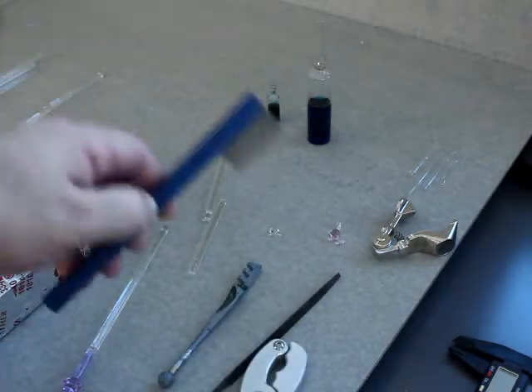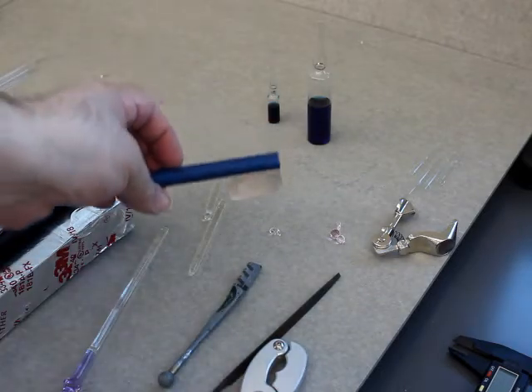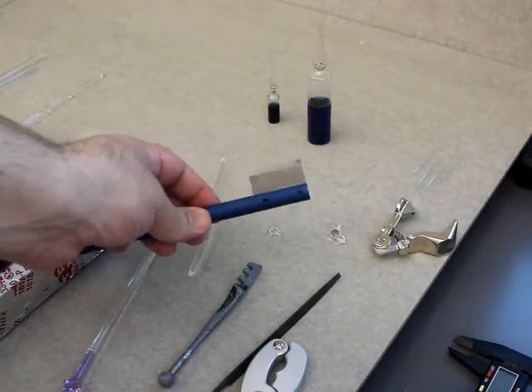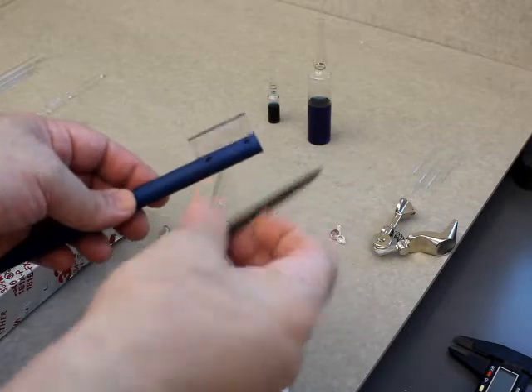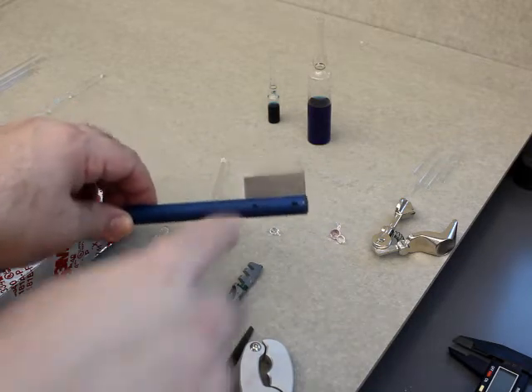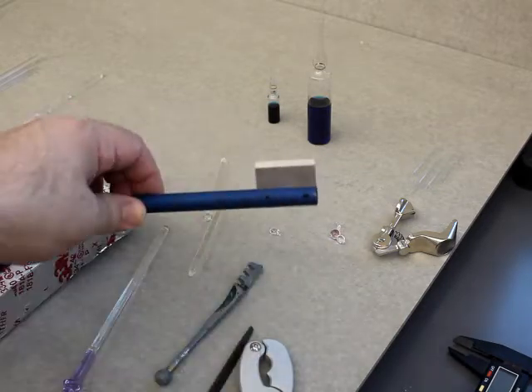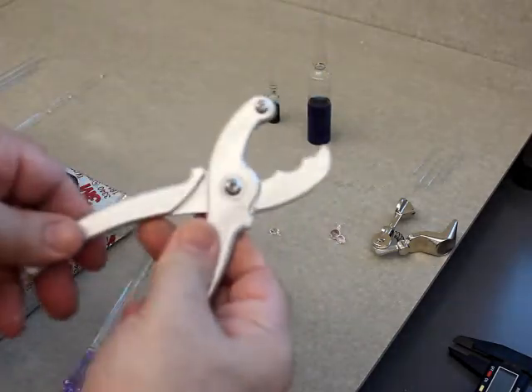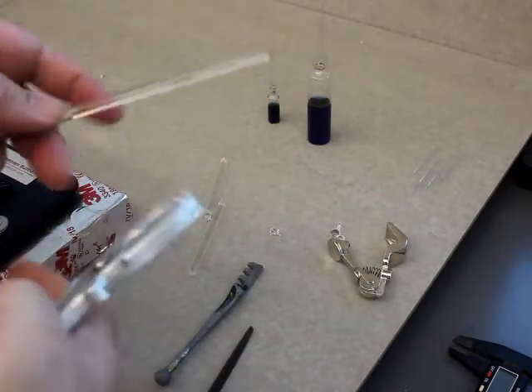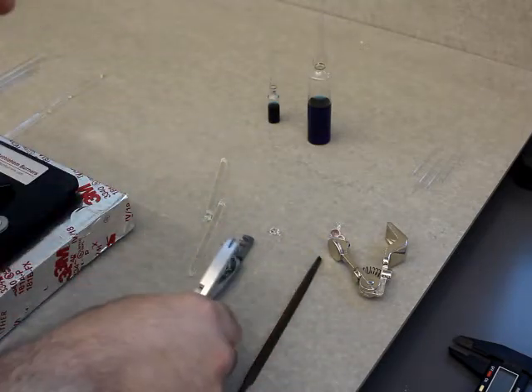Before I forget — the tungsten carbide blade is also excellent. This particular blade has seen about two and a half years of service and it's taken some damage, so I need to replace it. But it's exactly the same as how you work with the file: you score something and then snap it. These blades are razor sharp when you get them, so you have to be incredibly careful when working with one of these. However, these type of cutters are a little bit safer than doing it with the tungsten blade or the file.